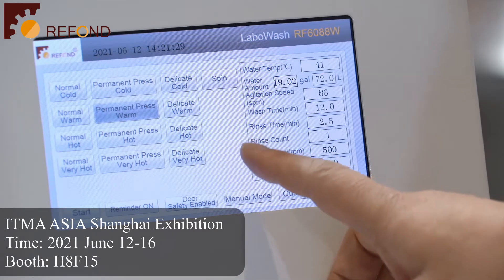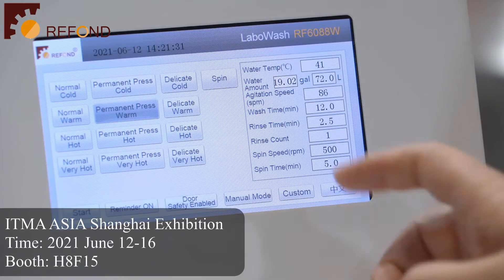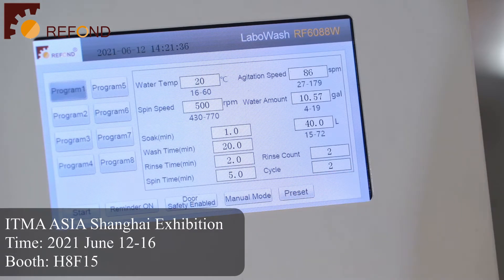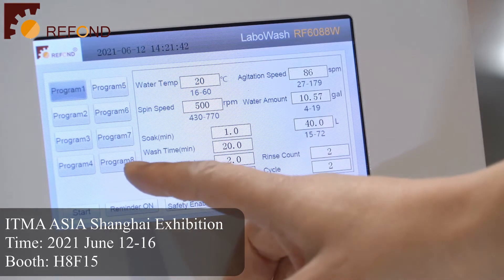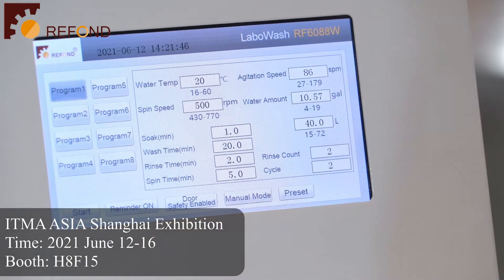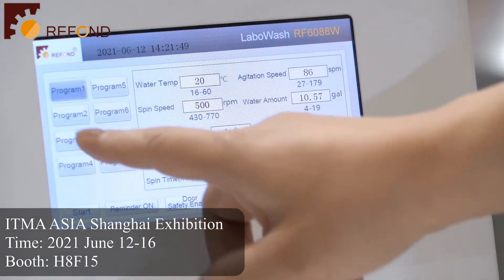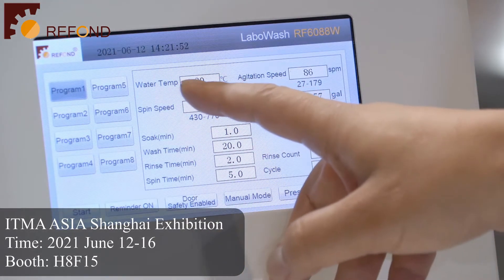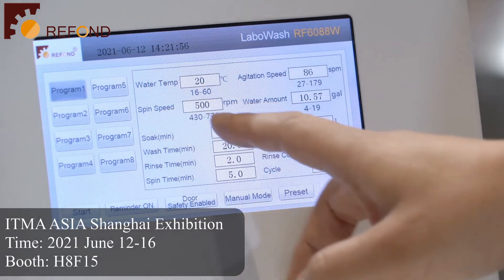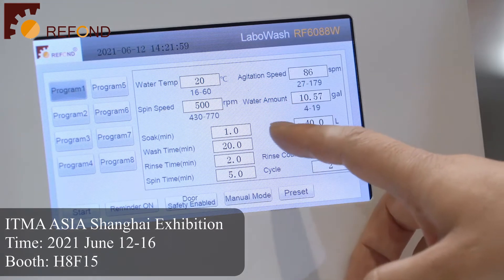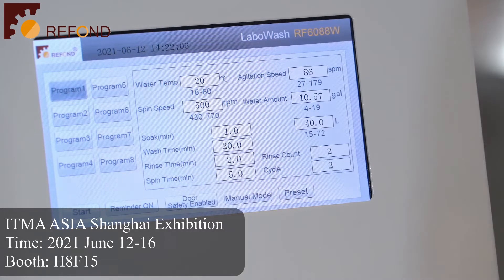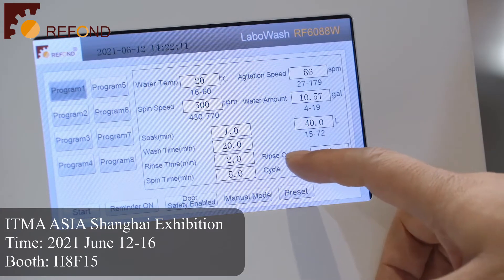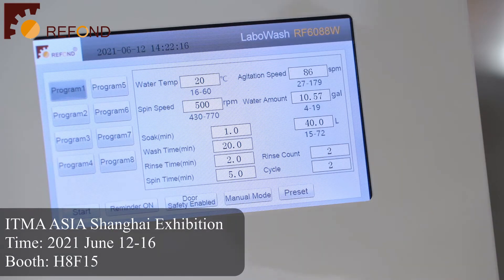If the customer wants to do their own testing program, they can switch to the customer program. There are a total of eight customer programs they can edit. When you select program one, you can change the water temperature, agitation speed, spring speed, water amount, soaping time, washing time, rinse time, and spring time. In addition, the rain scouter and the cycle number can also be set by the customer.